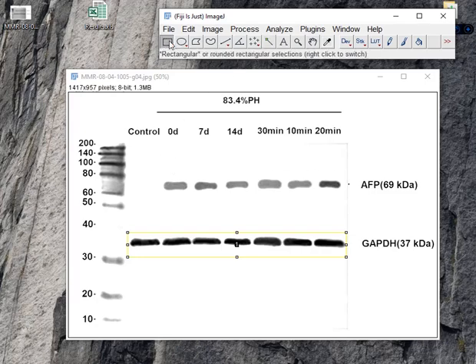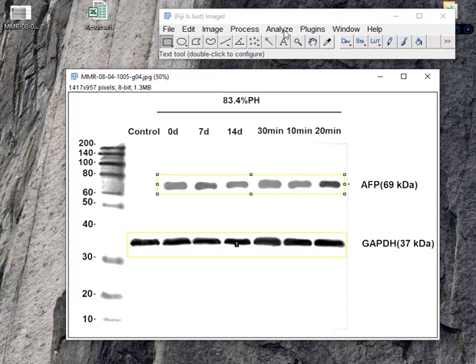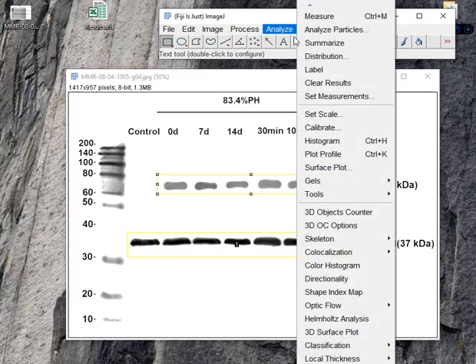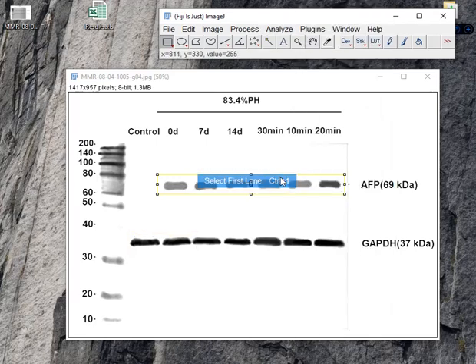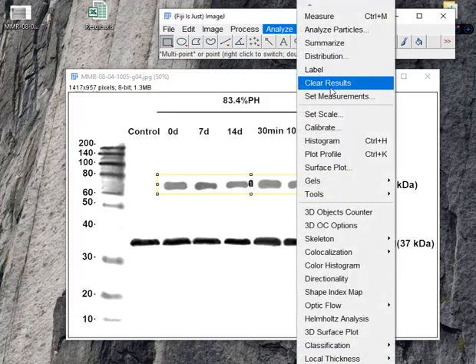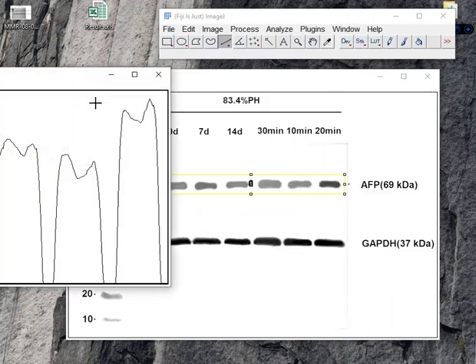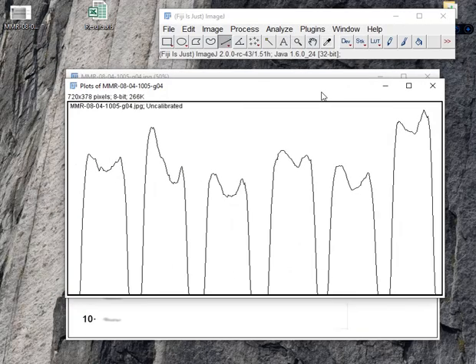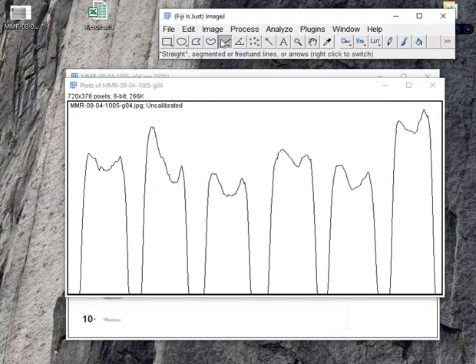So again I'm selecting the rectangular tool, selecting the second band, and clicking analyze, select first line. You can see it's my line. Then again analyze gels. These are the plot lines.